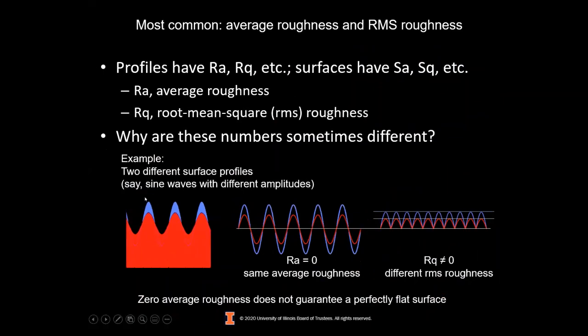The RQ value, if I say that the resolution of this technique vertically is generally around something like 20 nanometers, you might think that it can't really see very small RQs, but since RQ is smaller than the actual height of the feature, you can actually measure RQ in the few nanometer range.